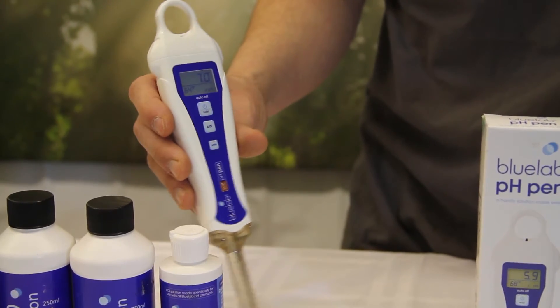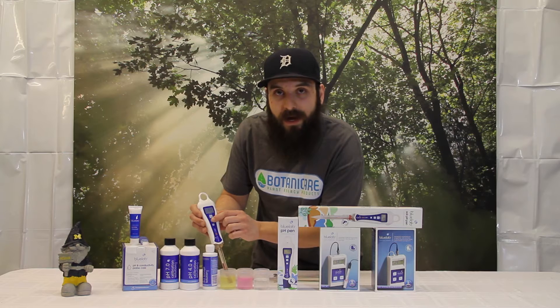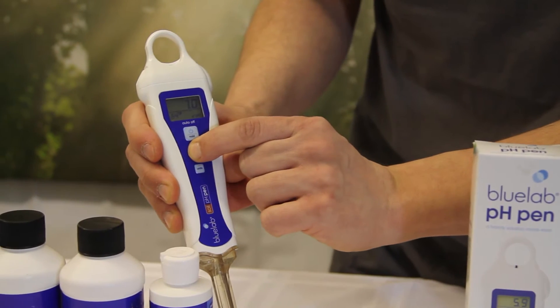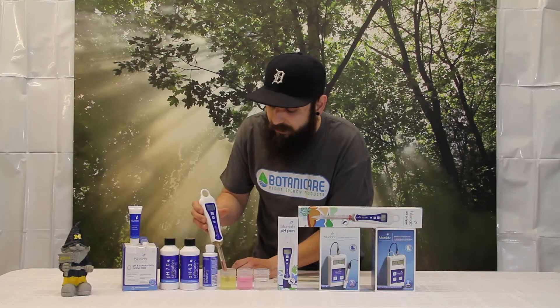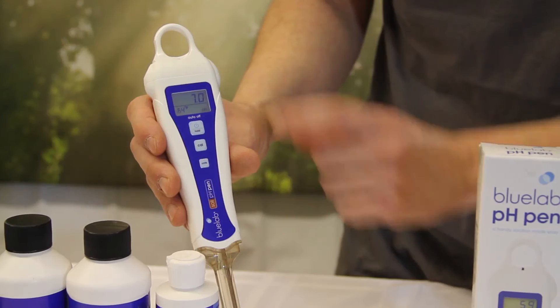Once it's stopped moving, we're going to go ahead and press and hold CAL. Give it a second, and once it says CAL, just a couple of seconds later it'll read 7.0. And there you go — 7.0.